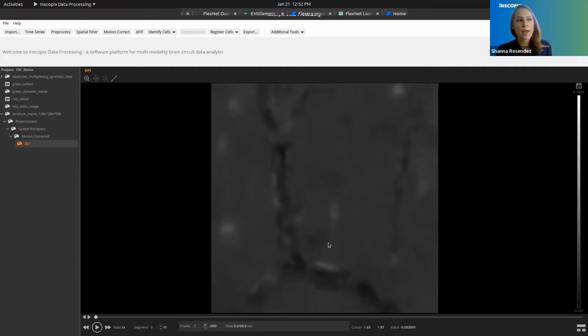Yeah, when I have people ask that question, it's really to get the micron value. So I think they're still going to need to go into ImageJ, which is fine. I just don't know of anybody that's specifically trying to do length in pixels. Well, you need it. So you need it for two functions that we've added for 1.6, which is entering in the average cell diameter.